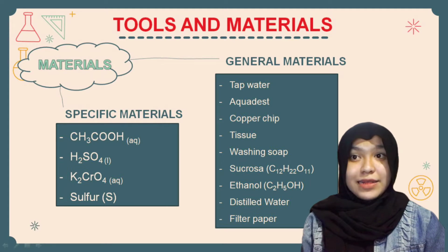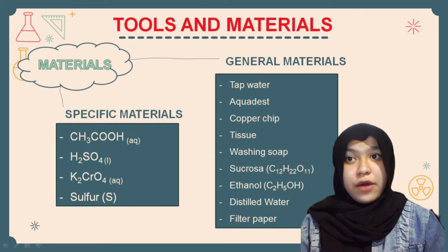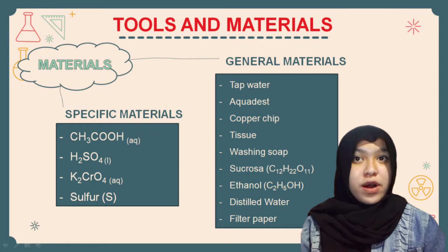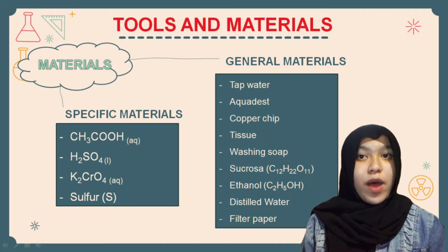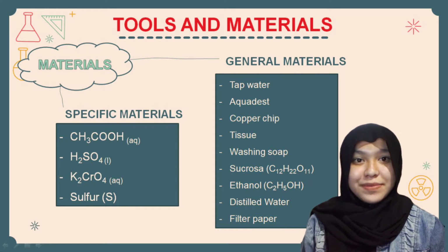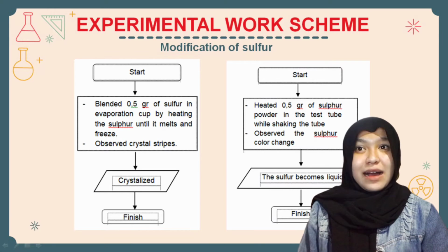Specific materials are CH3COOH, H2SO4, K2CrO4, and sulfur. General materials are tap water, aquades, copper chips, tissue, washing soap, sucrose, ethanol, distilled water, and filter paper.